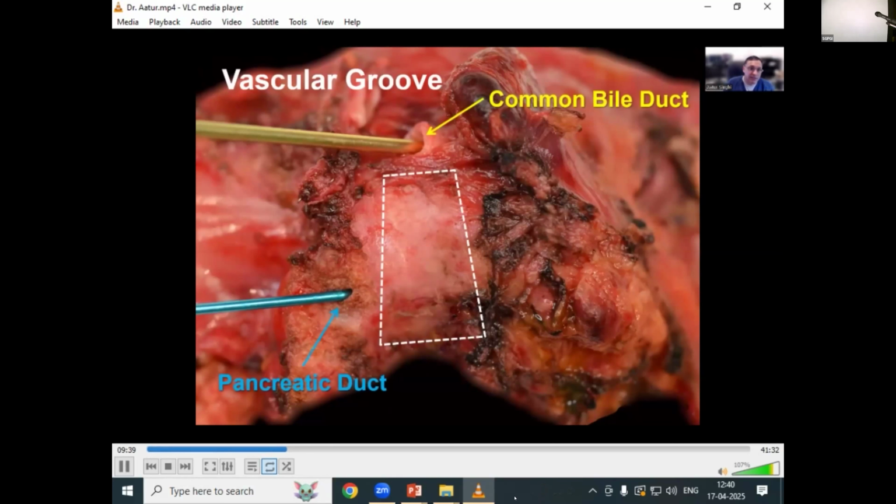Now, it's very easy to accidentally miss that bile duct and actually probe into a vascular structure. And therefore, putting that probe through the bile duct and then hitting the ampulla is imperative in making sure you are actually in that common bile duct. I've seen many people take an unfortunate pitfall in serially removing a vessel rather than the common bile duct margin.